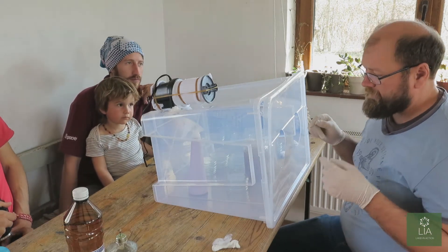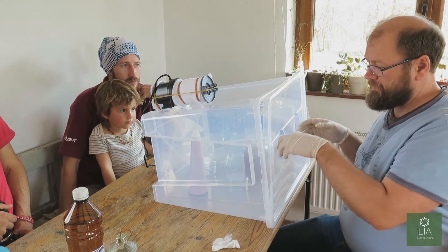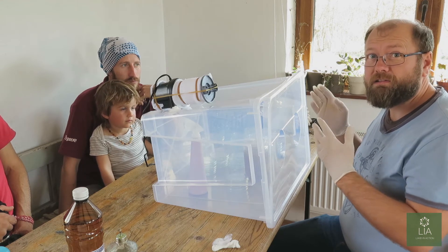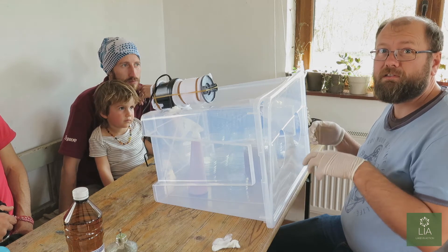The idea behind this is to work as quickly as possible. We want to basically lift, pour, close, move — lift, pour, close, move — and just keep the process as quick as possible so you don't get any contaminations into the Petri dishes.